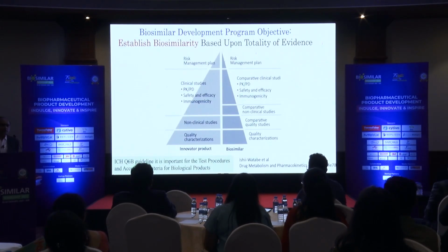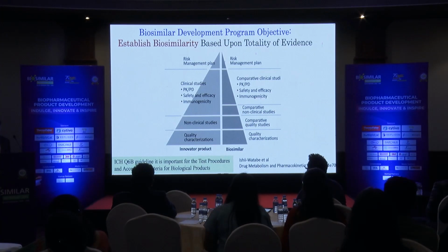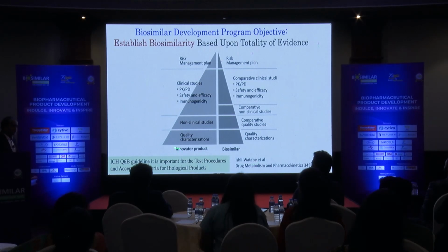If you compare the characterization, I'll keep it short because the audience knows everything. In a biosimilarity development program based on the totality of evidence, you require a robust analytical characterization, and some of the guidelines are important to test the product and acceptance criteria for biologics products. That is what is recommended by all of the regulatory agencies.